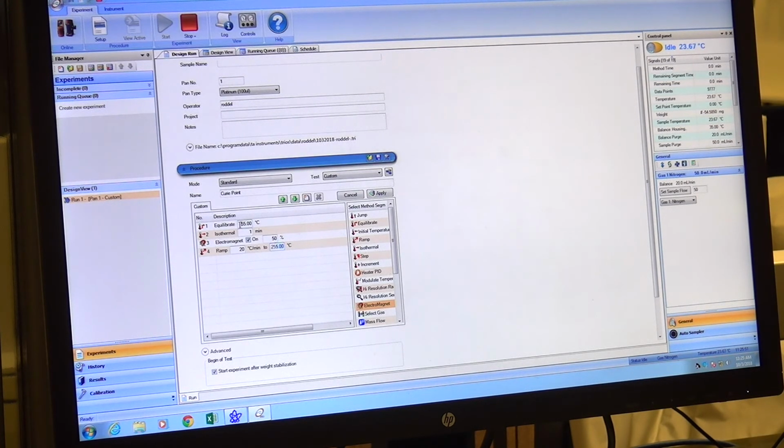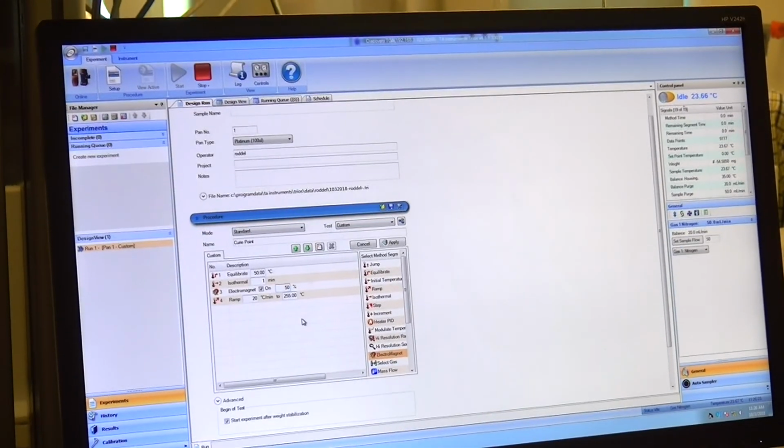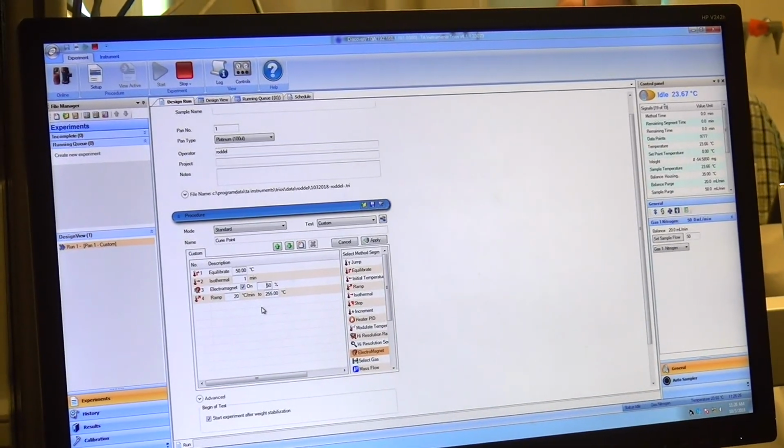Okay, so if I switch this out, if I say I equilibrate it to 500, let's say, then 500 is greater than 255, so it's actually going to cool down to 255 from 500, right? But now if this number is 50, then 50 is less than 255, so it's going to heat up to 255, right? So the ramp command controls both directions. It just depends on what your starting and final numbers are, okay? You don't have to put any negative signs or anything like that. Just tell it the starting and ending numbers, and it will decide which direction it has to go in.